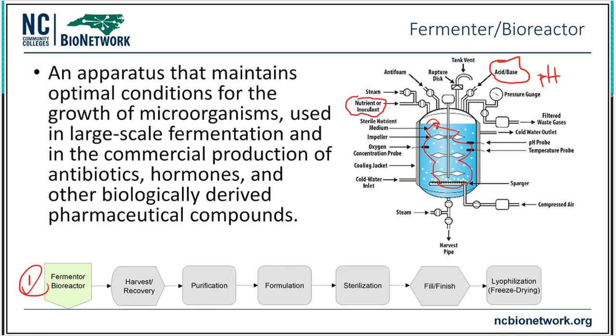Next up, as these things grow and do what they need to do, there is a chance that they are generating waste. And we can monitor that waste. We can take that waste out. But I've got to have a way that I can handle this without disturbing everything or killing everything in the meantime.